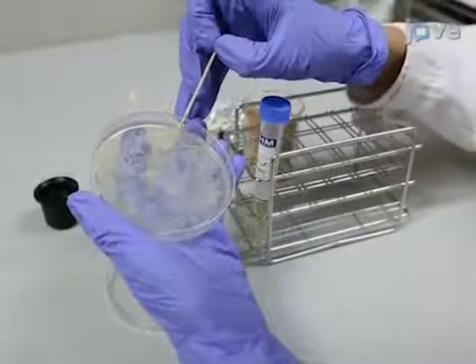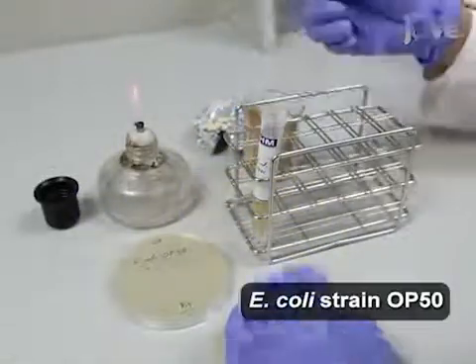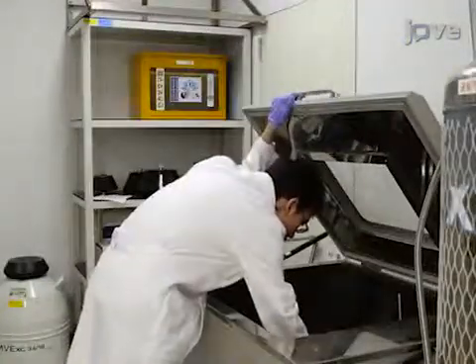Then, inoculate 10 milliliters of lysogeny broth with bacteria. Culture the bacterial inoculation at 37 degrees Celsius in a shaking incubator overnight.